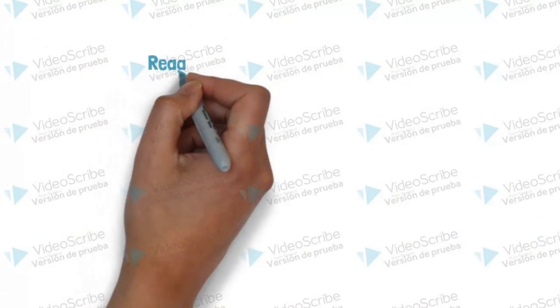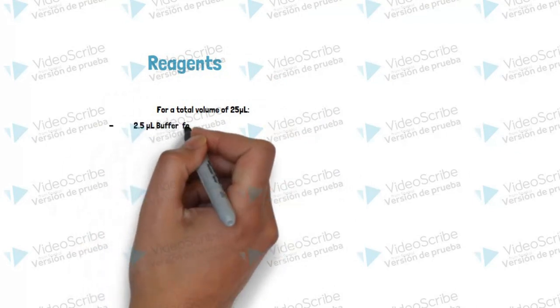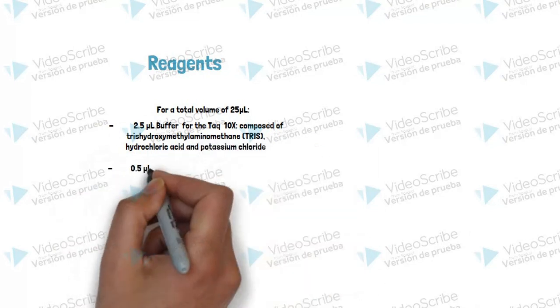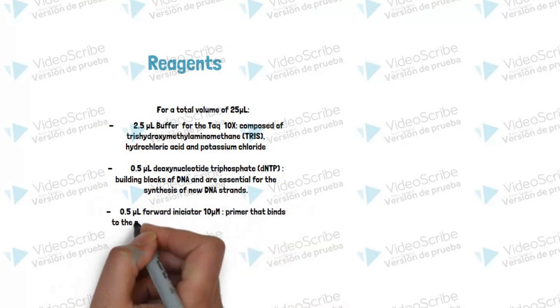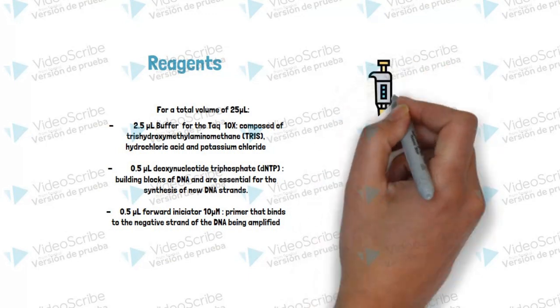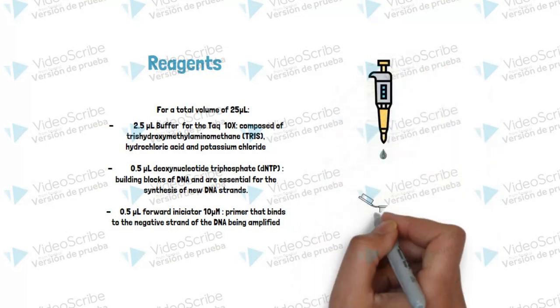Reagents used in this test are a buffer for the Taq enzyme, which is composed of Tris-hydrochloric acid and potassium chloride. Also, the deoxynucleotide triphosphates, which work as building blocks of the DNA and are essential for the synthesis of new DNA strands. The forward primer binds to the negative strand of the DNA that's being amplified.